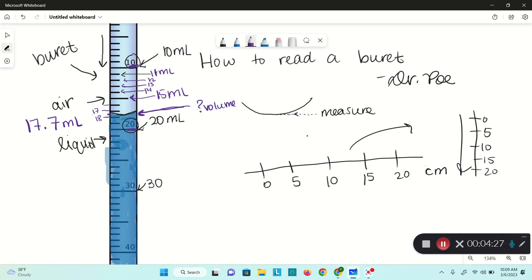To sum it all up, what are our steps to read a burette? Number one, we're going to look at the numbers provided, the numbers and lines provided on the burette.